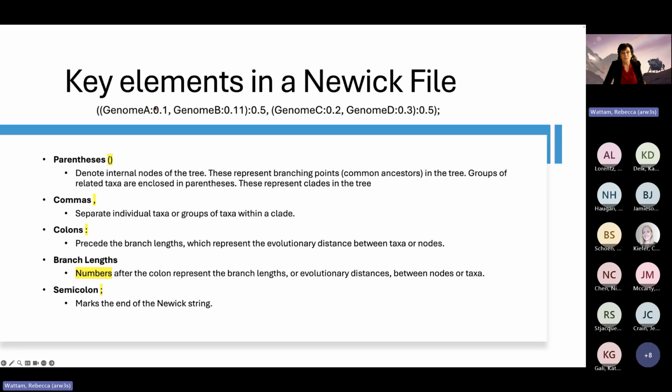So these two are separate, they're two separate organisms, and yet they're grouped together with this branch length. See, the comma is separating this guy from this guy. And here we have a colon with this branch length and a colon with this branch length, and those two things are separated by this branch length, and then it all ends nice and neatly with this beautiful little semicolon at the end. Very simple, right? Anybody should be able to read this once you see it.